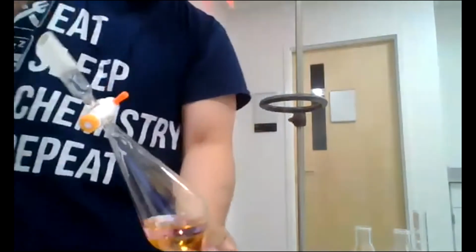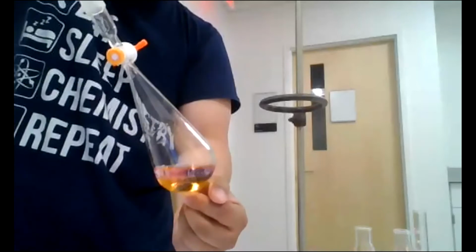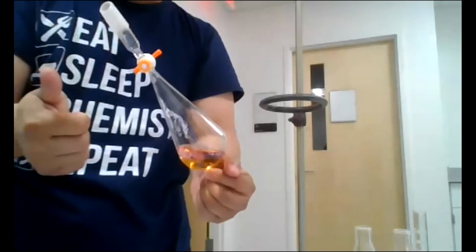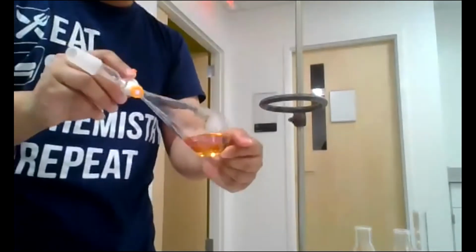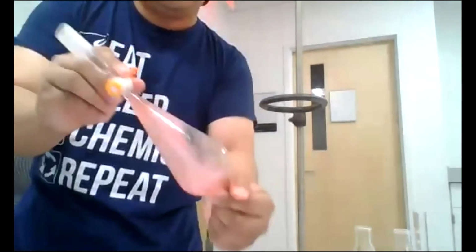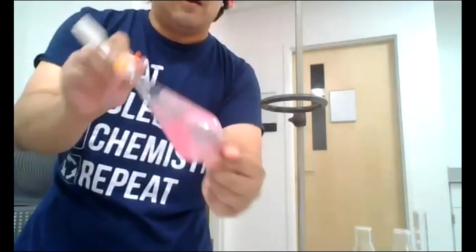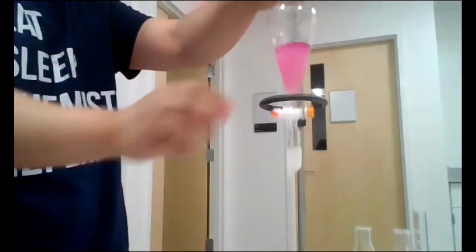So the idea is you're going to try to mix these two immiscible solvents so the iodine has a chance to be transferred from the water to the cyclohexane. At least that's what we're expecting. The process to do this is shake, vent, shake, vent, shake, vent. So I'm going to shake, and then I'm going to vent. I'm going to shake, I'm going to vent. I'm going to shake and vent. Back to the ring clamp.